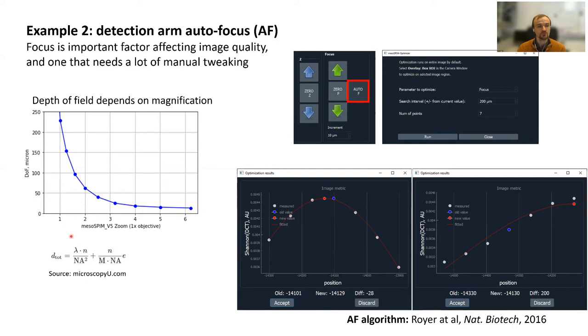To simplify the user experience, I implemented the autofocus feature in the software. It works quite straightforward. Within a given interval from the current position, it takes a number of snapshots at different defocus positions, then it fits with a Gaussian distribution and finds the peak of the Gaussian. The red dot is your new position. You can accept it and the microscope detection objective moves to that position. You can repeat it several times.